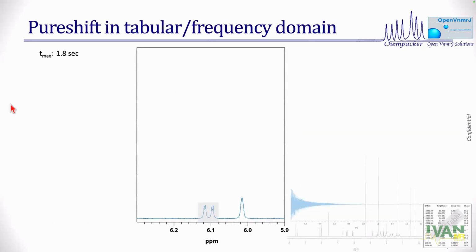So what do I mean by that in a picture format? Here is a FID, and there is a spectrum you see. I'm just going to focus upon a doublet of a doublet in that. This is prednisone, one of the datasets in the prednisone. I deliberately put this FID behind. I have the table that describes that.